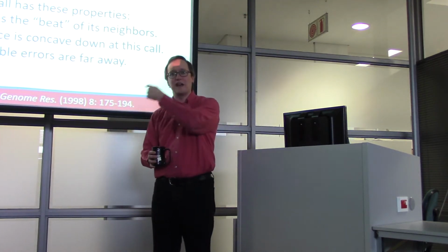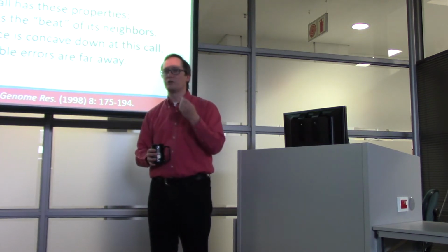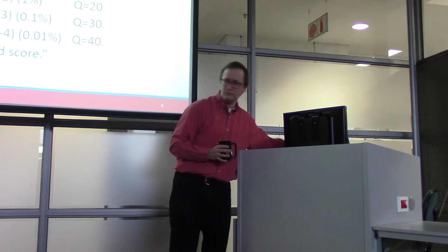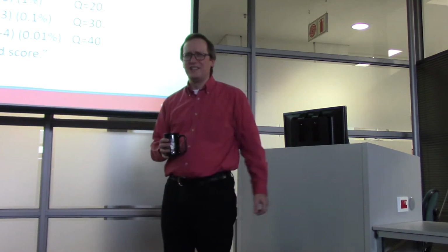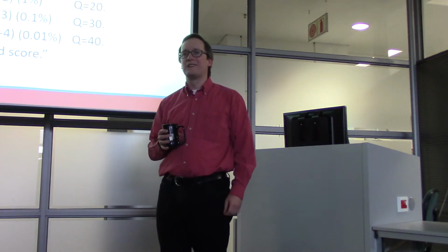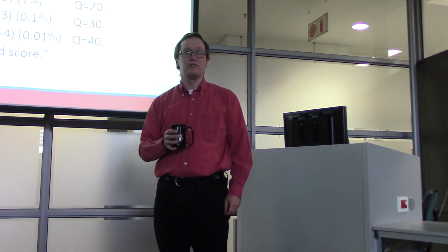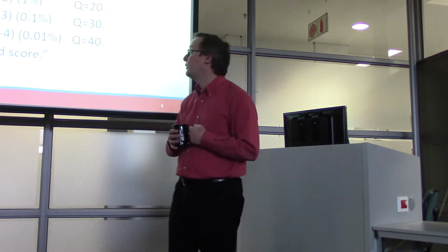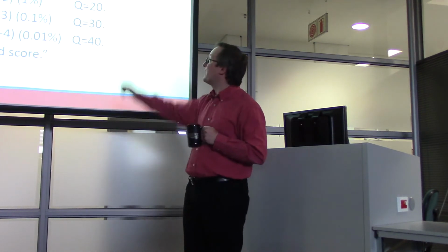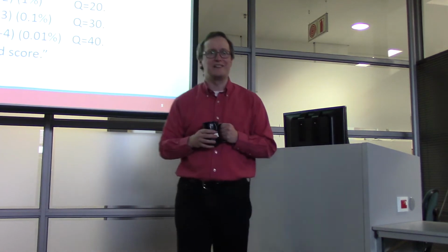So all of these factors are taken into account when we're trying to assess the probability of error at an individual site. I went over this a little bit last week, but I want to have a slide to talk about it too. We use a lot of negative logarithmic scoring in bioinformatics. The reason we do this is that proximity to zero matters a lot.